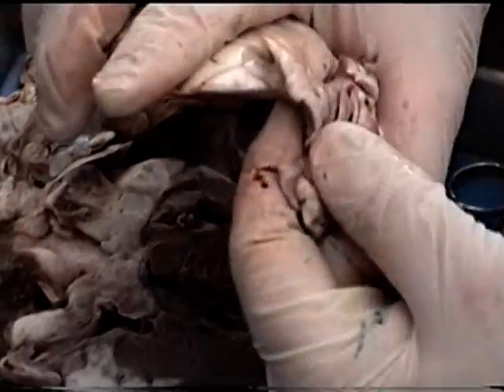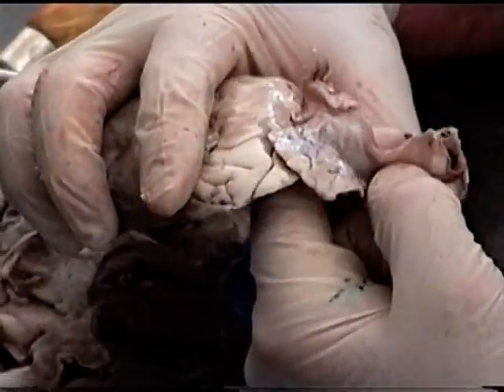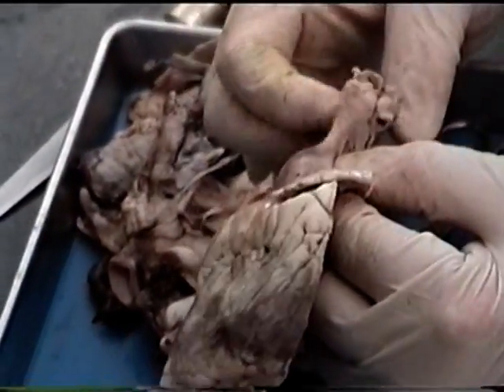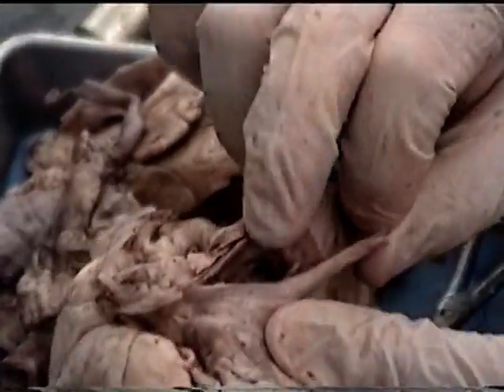Now sometimes what you can do, which is kind of cool, is when you're in the right atrium, you can actually find openings through which blood vessels were coming to and away from the right atrium. So this is the old superior vena cava that we're seeing right here that would have brought blood into the right atrium.